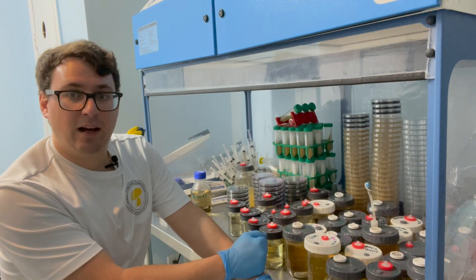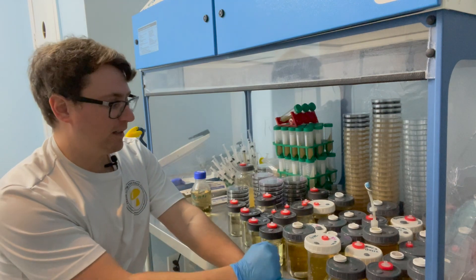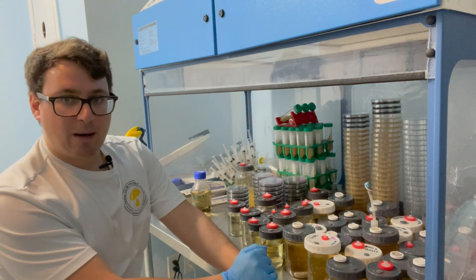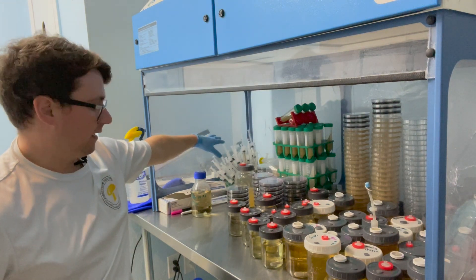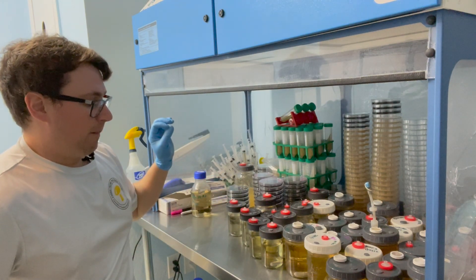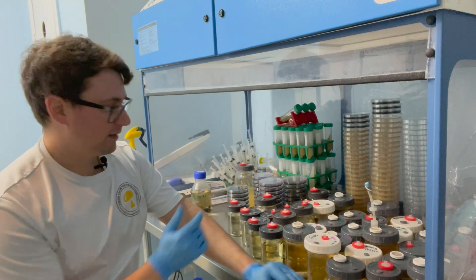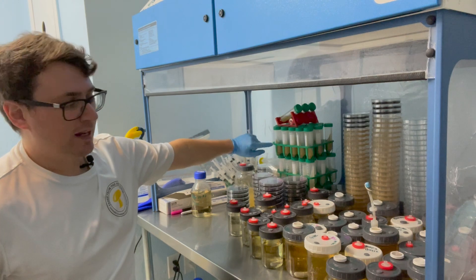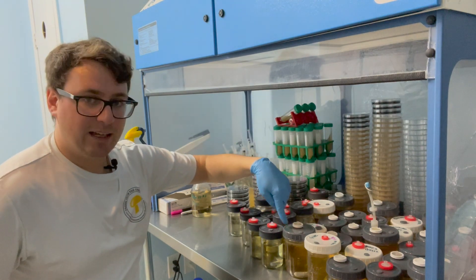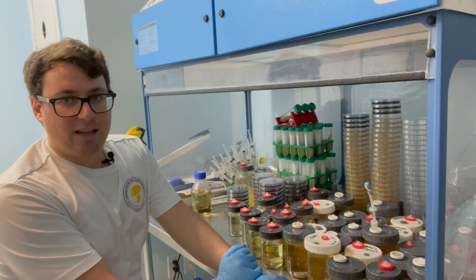I'm going through about a batch a month now, so my QCs are getting more and more dialed in every single time. There are a couple of things I could have done better for workflow processes, but I've got my backup syringes here that I'll be using in about three months for my production. Once I do my first runs for fruiting, I will verify the health of these — otherwise I'd just go back to the G1 slant cultures. Any of these that do show up positive, I'll go back to the slant mother culture, inoculate a new liquid culture, and that way I will always have backups of all the strains I'm working with.